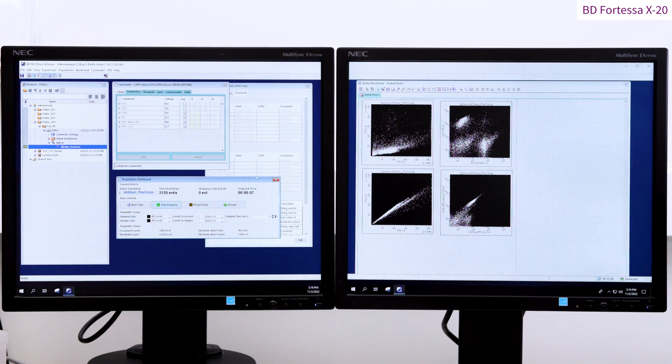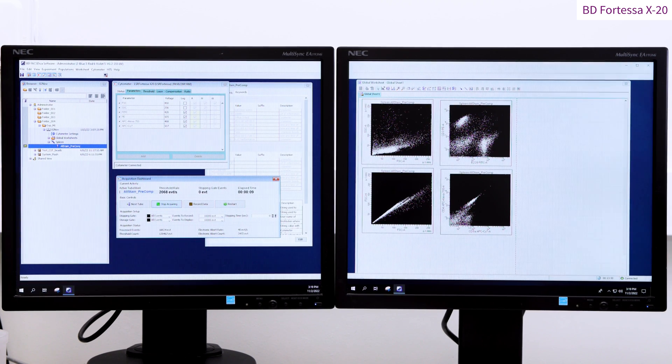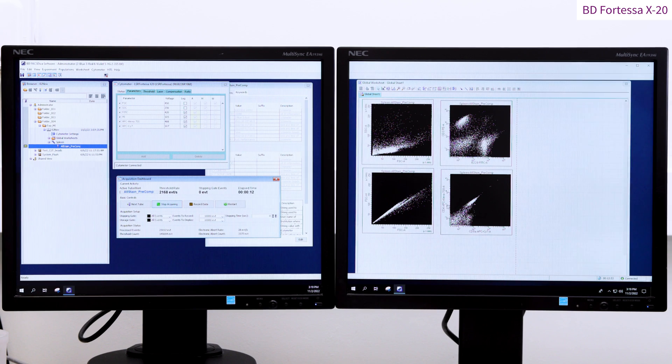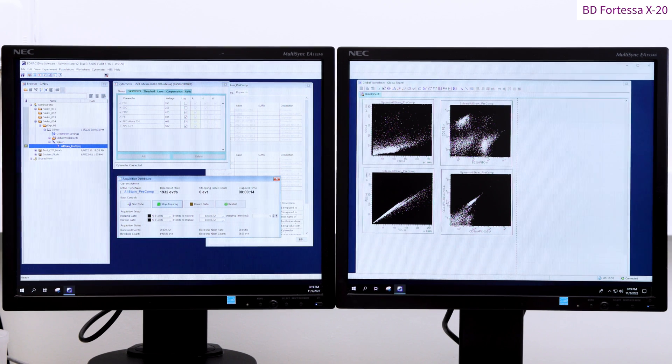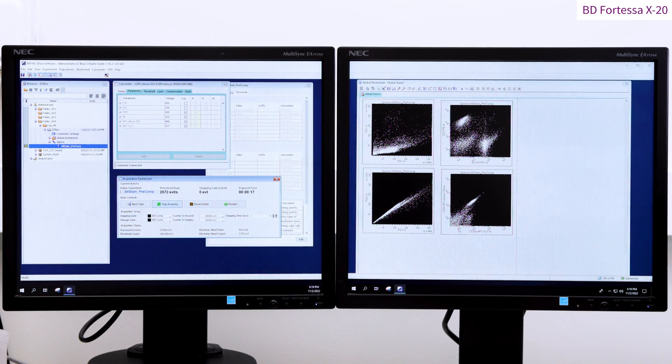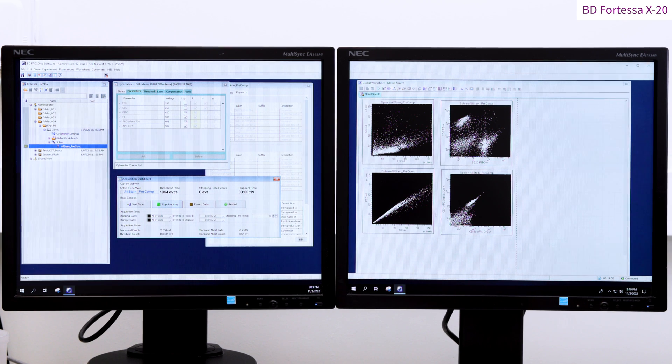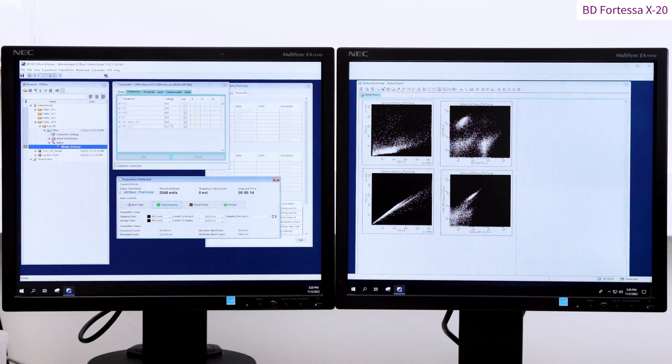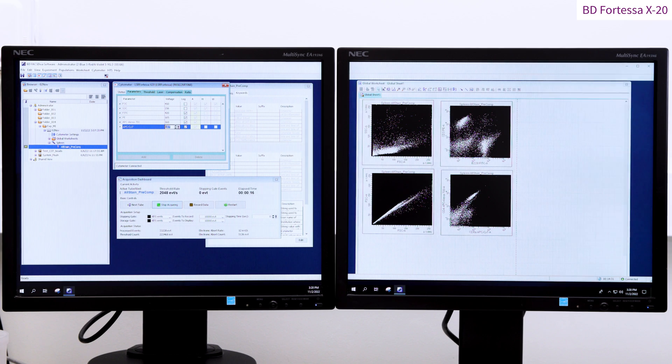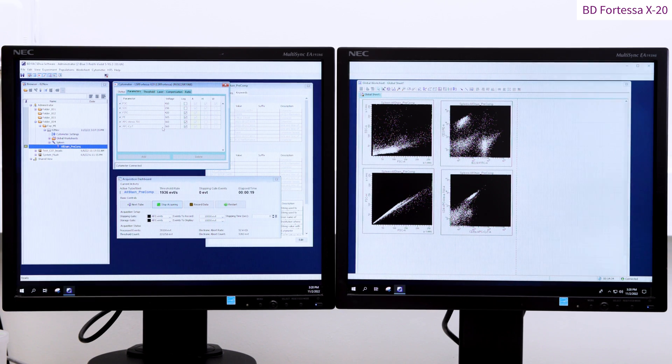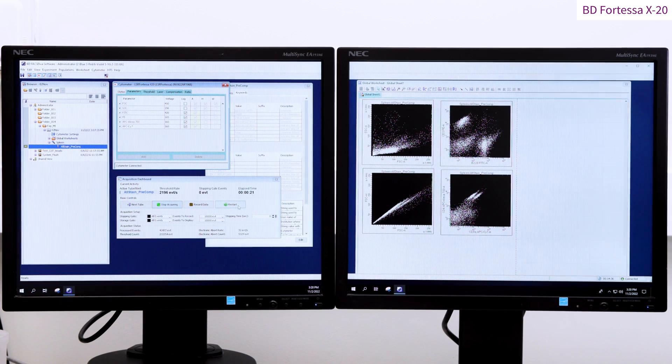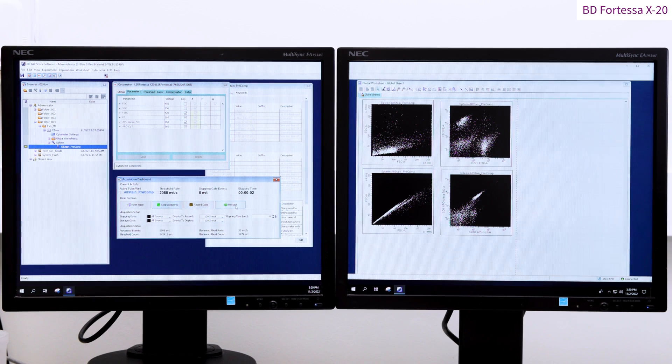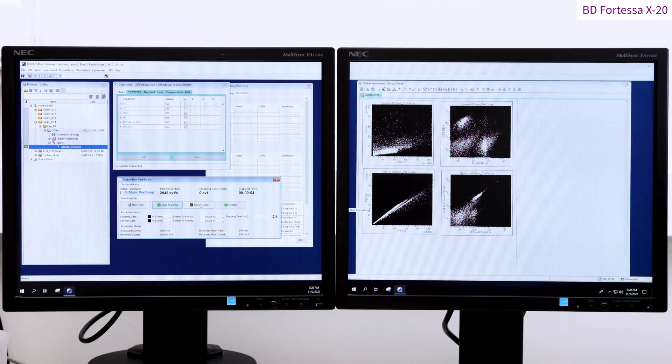The signal intensities for our phenotypic markers are within the detection scales. However, some of the negative events are crushed against the dot plot axis. So to enhance the detection of CD4 and CD8 phenotypic markers, we are now going to increase the voltage related to those parameters. Once the voltages have been set at relevant values, we can now record the data by pressing the record button located in the acquisition dashboard.